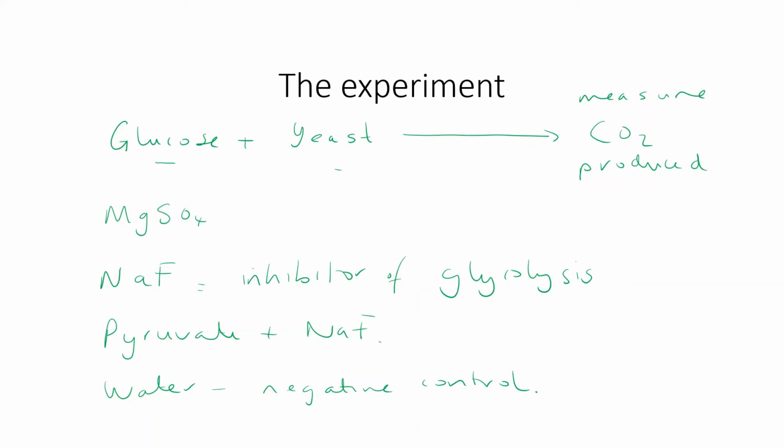So without further ado, I'll let you see me in the lab doing the experiment, and what's going to happen is I'm going to be sending you some raw data so that you can average that to create a nice graph that'll help you explain the results and hypothesize and understand this whole process.